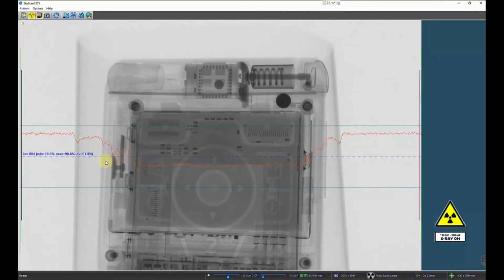And so you can still proceed with imaging in this type of case, because in most views we're going to have good transmission, but we do know that there will be extra noise and some artifacts that arise in our reconstructed results due to the low transmission we have when we're going through the thick view of the sample.